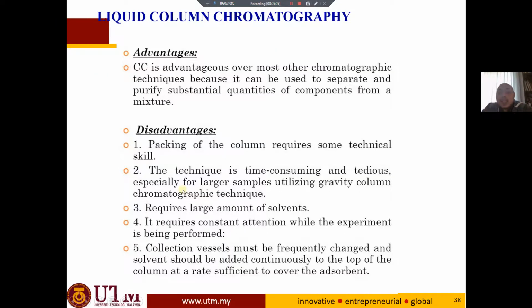And here are the advantages and disadvantages of liquid column chromatography. LCC is advantageous over most other chromatography techniques because it can be used to separate and purify substantial quantities of components from a mixture.